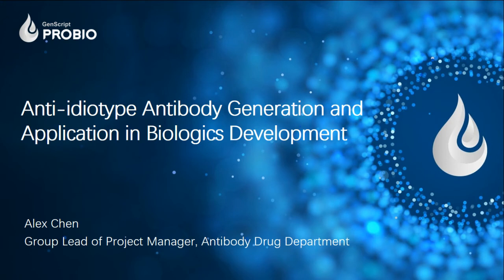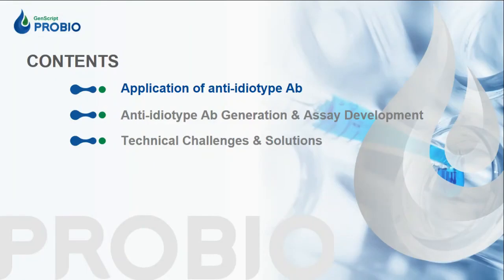In this session, I will talk about the generation and application of anti-idiotype antibody in biologics development. During this presentation, I will first give an overview of the application of anti-idiotype antibody during preclinical and clinical study. Then I will go over the general strategies of anti-id generation and kit development. Lastly, we will discuss some of the technical challenges in detail during the process and provide solutions.